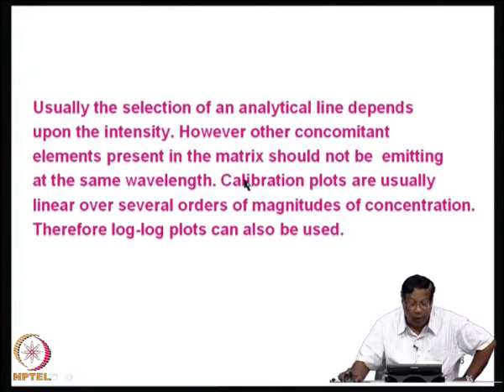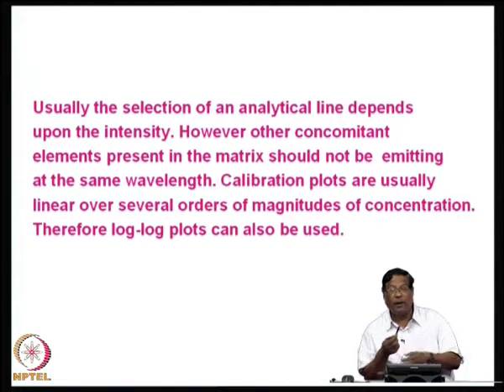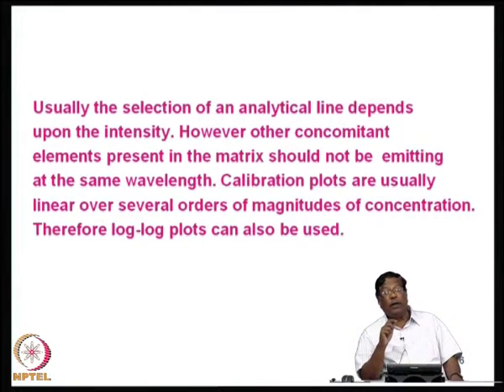So, the calibration plots as usual are linear over several orders of magnitude, and this presents a problem, because if the order is very high, then you will have to use not just a simple graph, but you may have to use log plots, log of concentration versus log of counts, because you are varying from a few counts to several lakhs of counts in the same calibration curve.